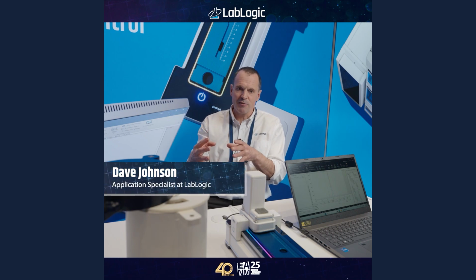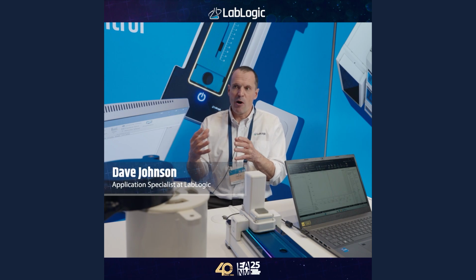Lead-212 generates bismuth-212 in the body. It's an alpha emitter that can have a really powerful therapeutic impact on tumors. Lead-212 is actually not an alpha emitter. The daughters are bismuth-212 as well as polonium-212. And with the purification process that we have, we obtain pure lead.